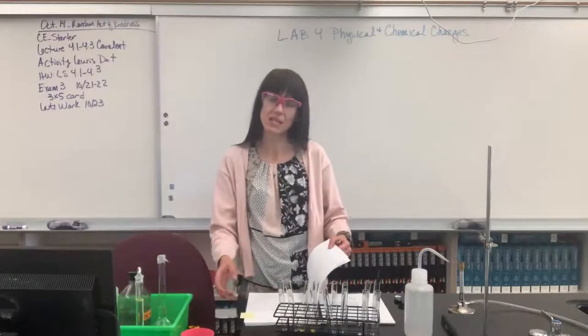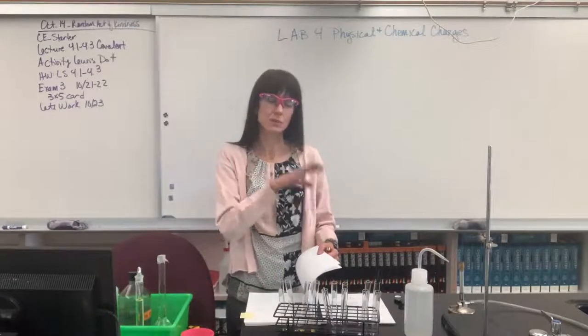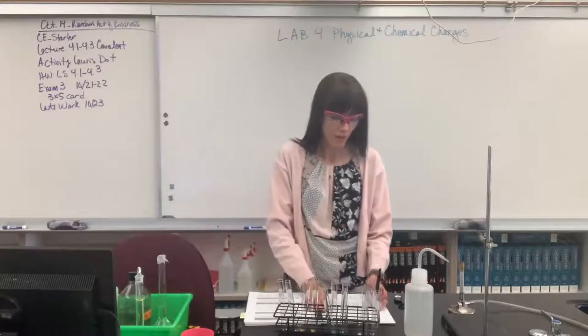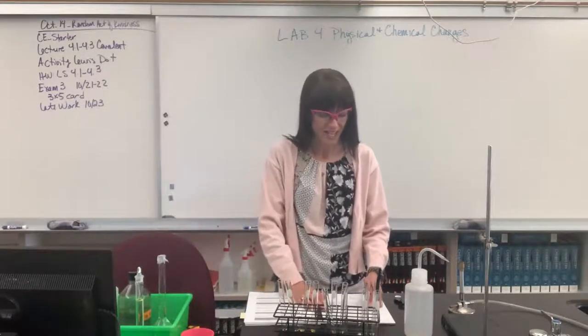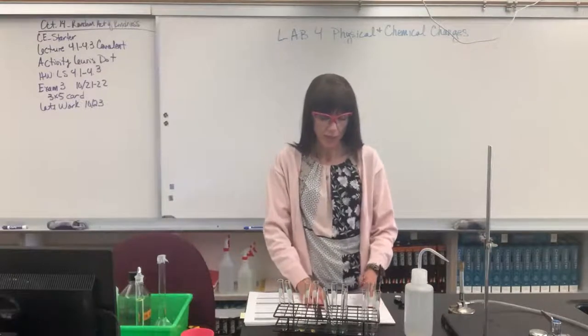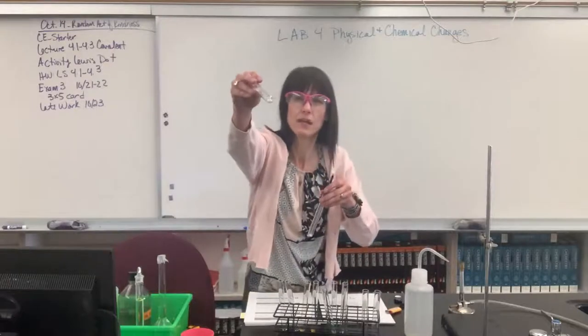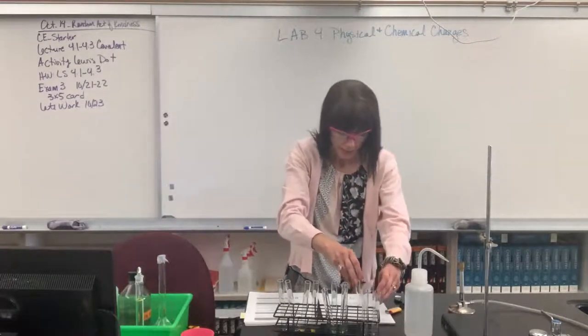So if you want to put a little sticky note, put your finger there. We're going to go back and forth between the experiment and then recording the data. Okay, so I'm on page 46. I'm looking at solution formation. It's part A. It says procedure number one. It says weigh out two samples of sodium chloride. So I've done that. There's 0.2 grams of sodium chloride in each of these little test tubes.